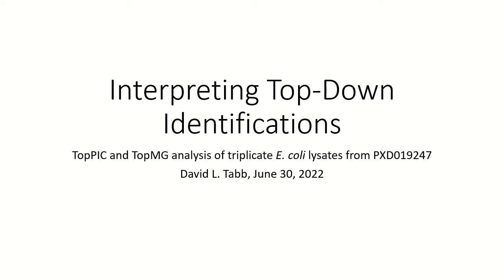lysates. These were collected via data-dependent acquisition, which means that the instrument tried to produce tandem mass spectra from the most intense proteoform ions that were observed in the MS scan. And it was performed on a Fusion instrument, a Thermo Fusion. So we have a large number of spectra that have been collected.